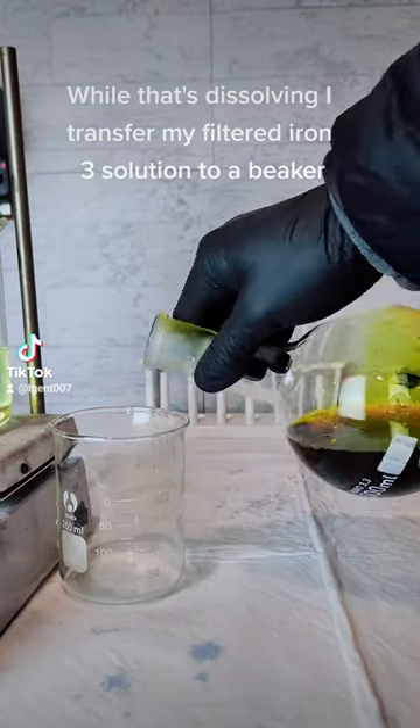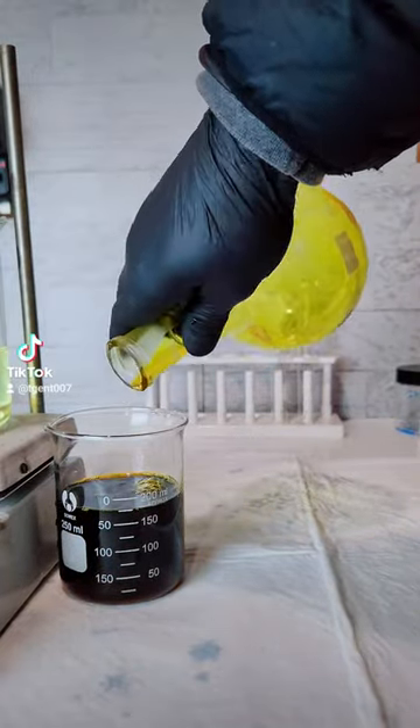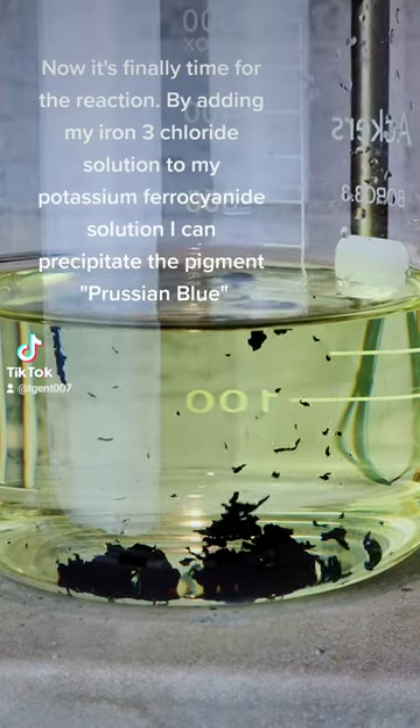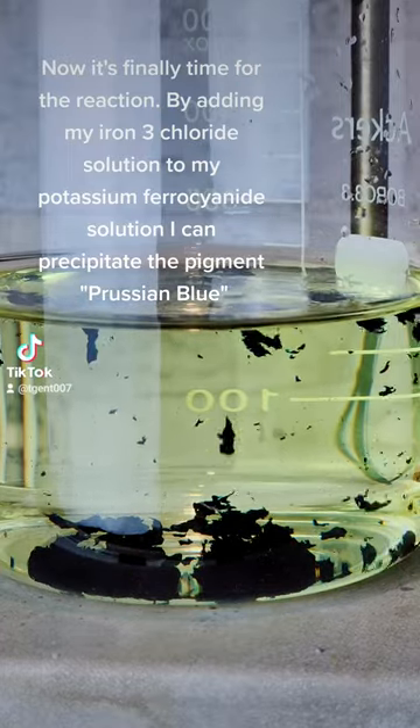While that's dissolving I transfer my filtered iron 3 solution to a beaker. Now it's finally time for the reaction. By adding my iron 3 chloride solution to my potassium ferrocyanide solution, I can precipitate the pigment Prussian blue.